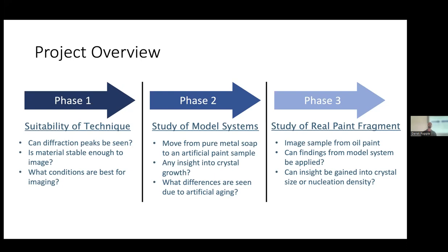So look at a simplified case of the real thing to see if we can gain any insights into crystal growth, especially with respect to artificial aging under different conditions, such as variable temperature and variable humidity, trying to figure out what affects this crystallization, and how this perturbs the size of the crystals or how they pack, things like that.